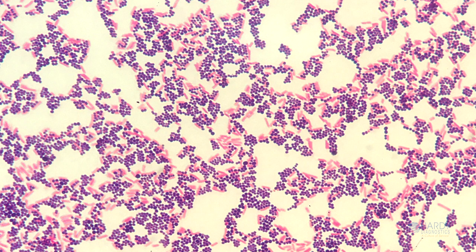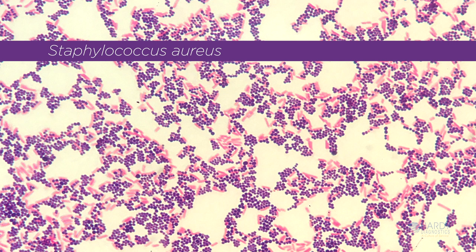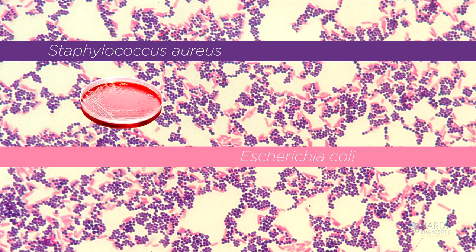Here you see two organisms routinely used for quality inspection at Hardy Diagnostics. The purple gram-positive cocci are Staph aureus. The pink gram-negative rods are E. coli.